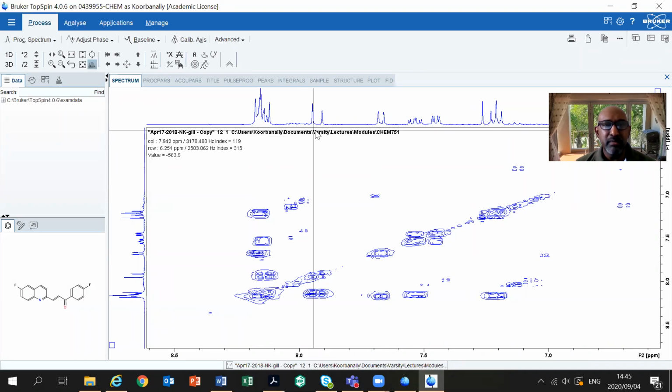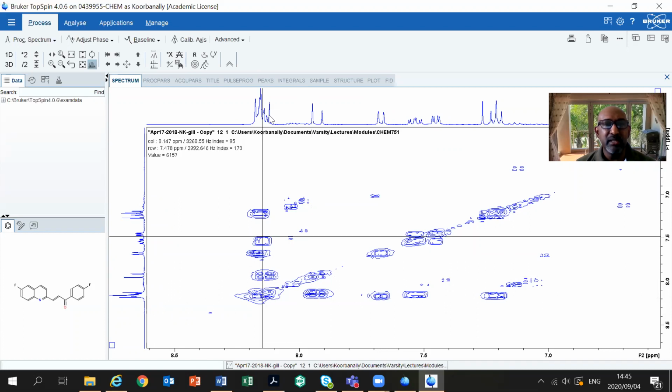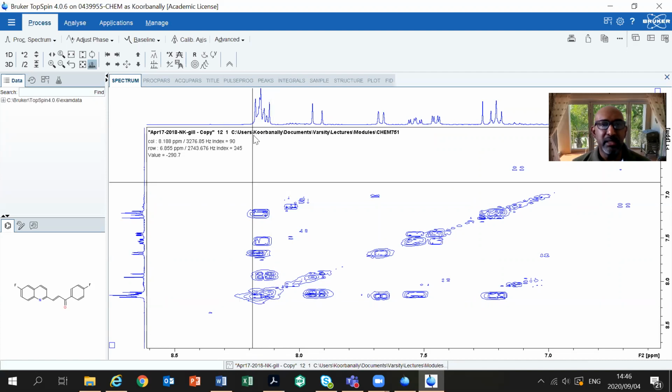And let me look at my big coupling constant. I'm going to go down to the diagonal. Can you see that box that I'm making here? Which means that the other proton coupled to that particular resonance is also in this overlapping of peaks that we see here as well. So I've identified all my 5 overlapping peaks as in these overlapping peaks that I'm seeing here, roughly between 8.1 and 8.3, right? So this region here.